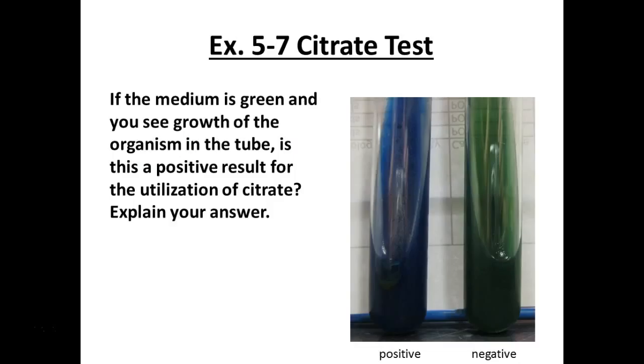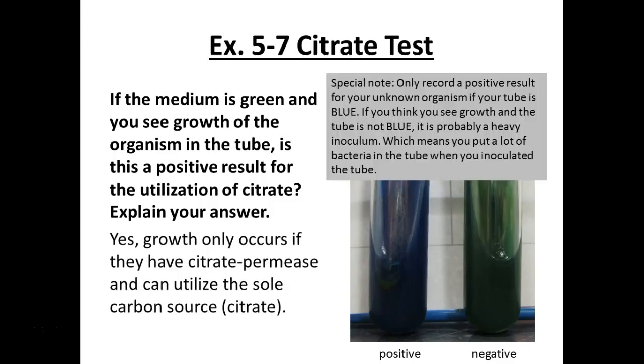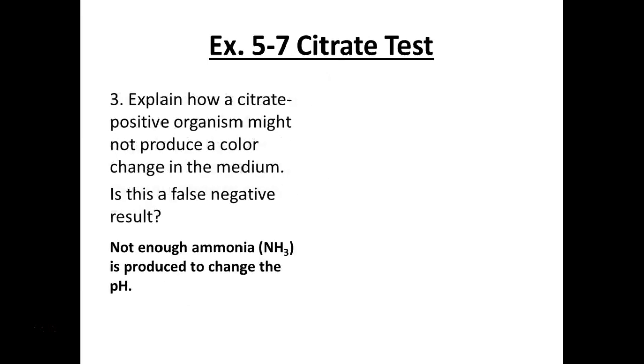If the media is green and you see growth of the organism in the tube, is this a positive result for the utilization of citrate? Normally, yes, but I caution you, special note: if you think you're seeing growth in a green tube, you are probably not. You're seeing what's called a heavy inoculum, which means you put too much bacteria in your tube to start with. Growth would be a lot more than what you're seeing. And these have been going for so long that only if your tube is blue is it actually positive. Okay?